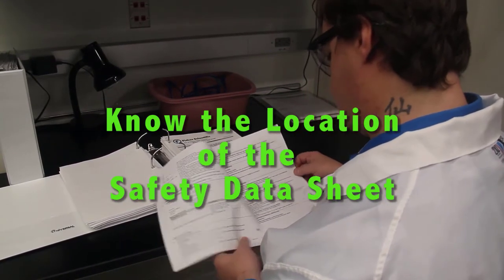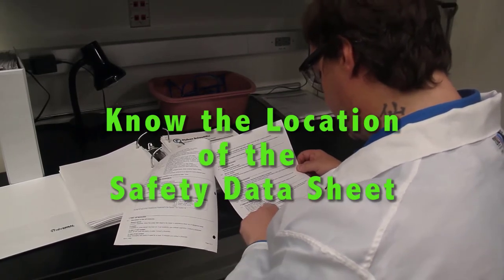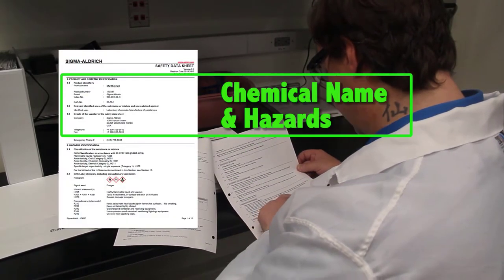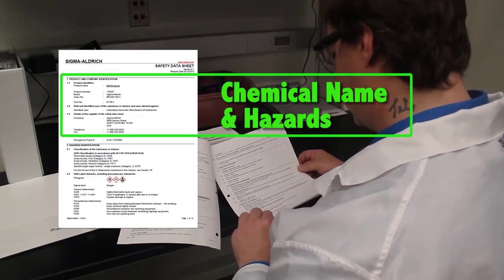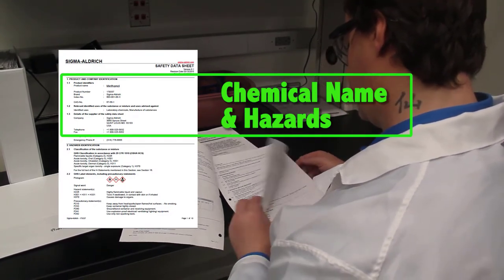The SDS binder is frequently located near the lab entrance. The first page of the SDS tells you critical information for chemical identification and potential health hazards.